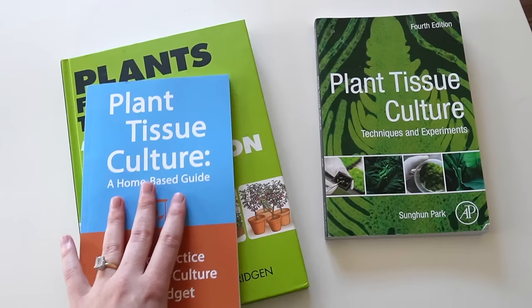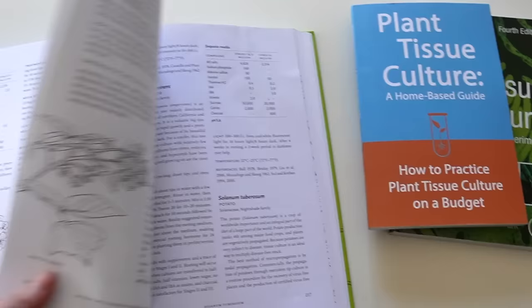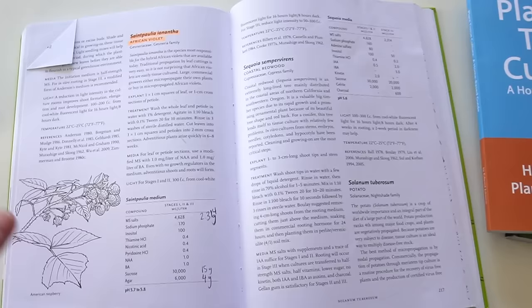A protocol is basically a set of instructions for tissue culturing a certain plant. It'll tell you which plant growth regulators to use, how to make the media and what ingredients to mix in, when to subculture the plants, and the light and temperature you should keep the culture vessels at. If you buy books like these, there are always protocols in the back. Here is one protocol that I've used many times for African violets, and it works great.